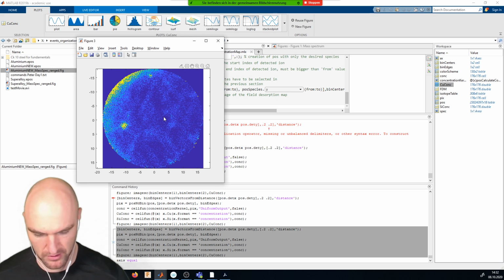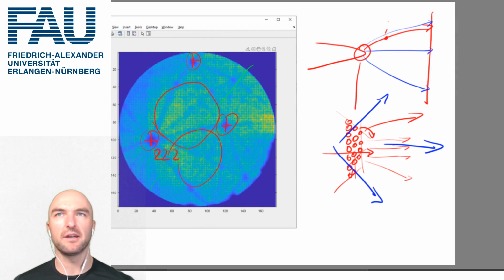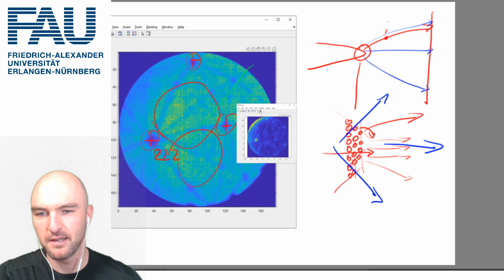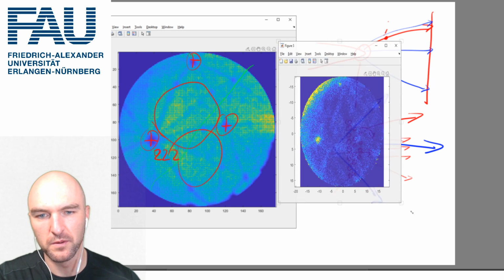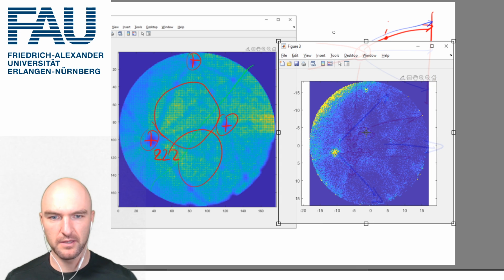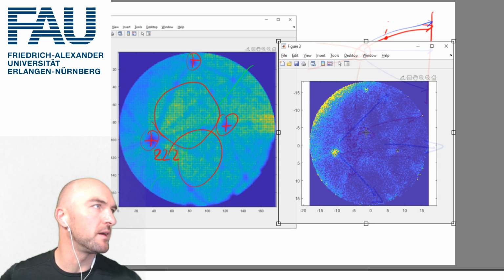And let me just go alt print screen and move down to the tablet. And you can see if you compare the two maps, okay, this pole here has more copper, this pole here has more copper.